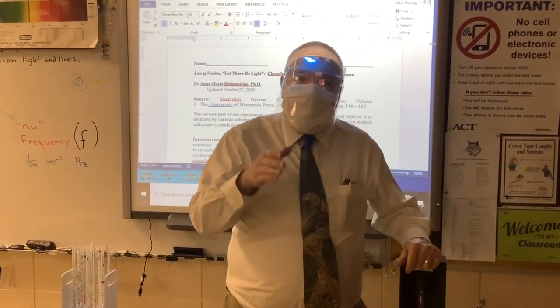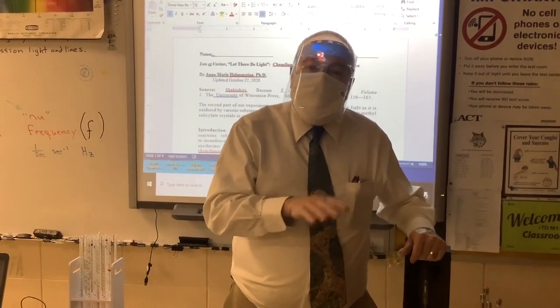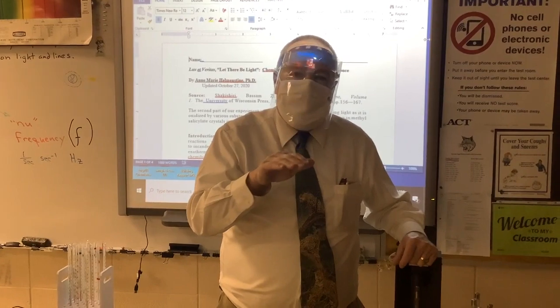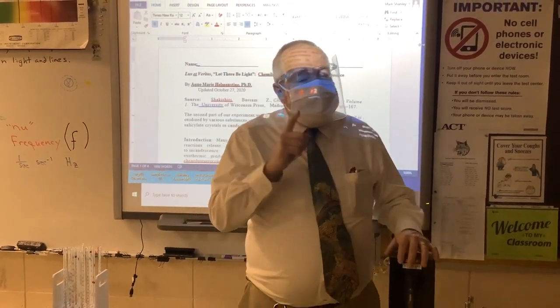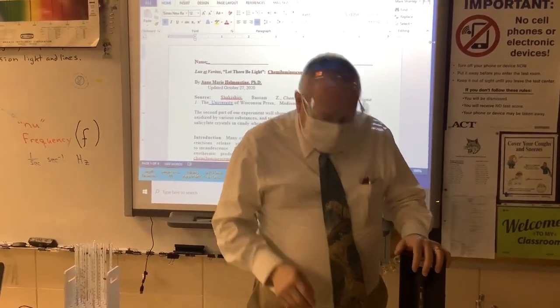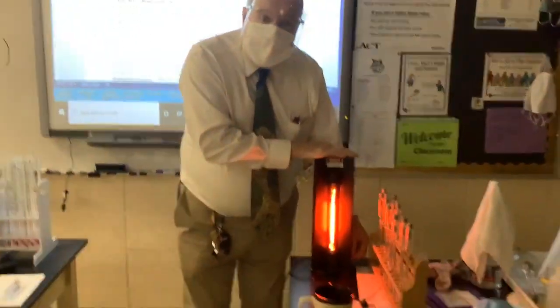And by decay, I mean go back to the ground state, to the original orbital they were in where they belong, because they don't belong in these higher energy orbitals. It's not energetically favorable for them to be there unless there's an input of energy. That energy does not have to be thermal energy. We're going to look at a couple of other ways of exciting electrons. One way is to pass an electric current through a substance.